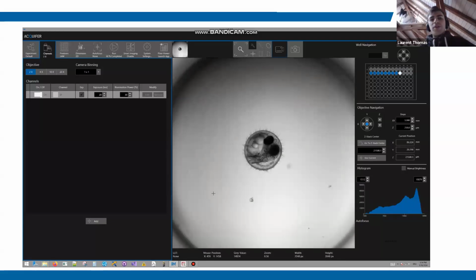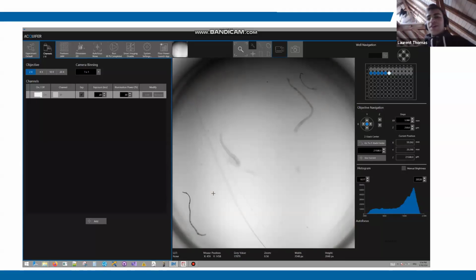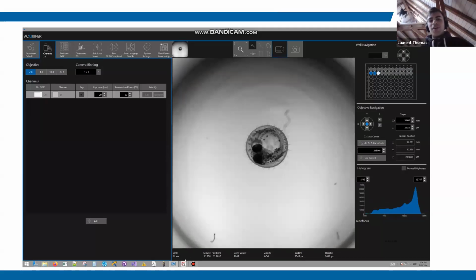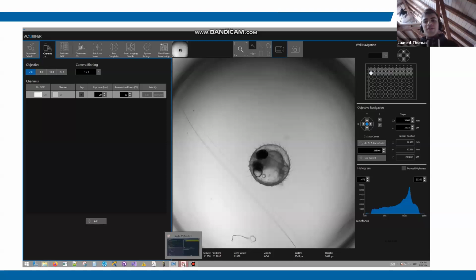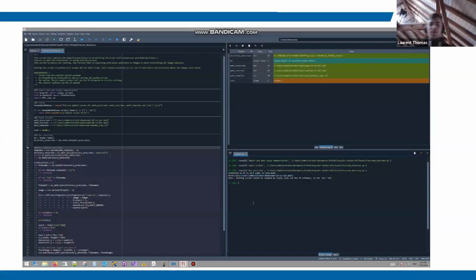It's very well prepared, the samples were quite in the center, but typically this can deviate. Or for other samples that could also be used, where, I don't know, we want to look at some larger organism and a specific organ, then the template matching would make more sense. But this again is just for the sake of the example. So this now returned. The command also returns the directory of the images, so I can look into it.